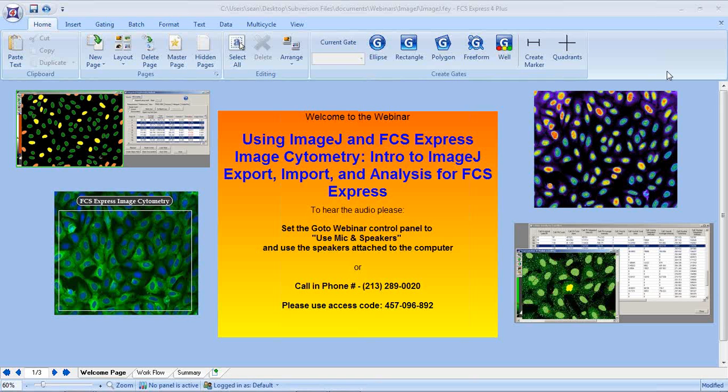The main principles of flow cytometry and image cytometry overlap, such as taking multi-channel fluorescence data and plotting that data in scatter plots and histograms so that you can look for statistically significant differences and changes. But what we can now do is take your image cytometry data a step further by leveraging the most powerful analytical tools in our flow cytometry analysis software.